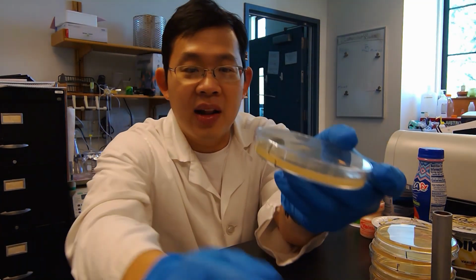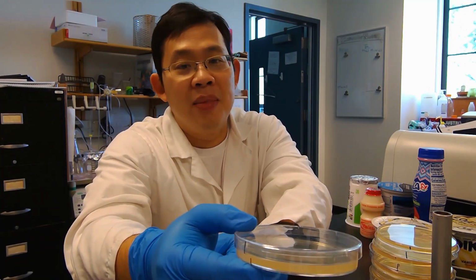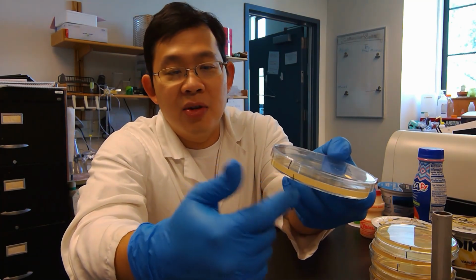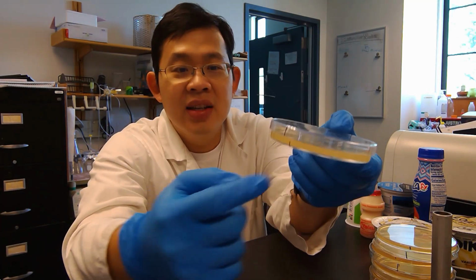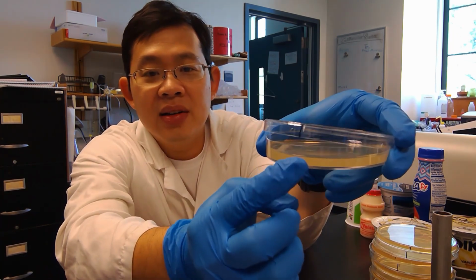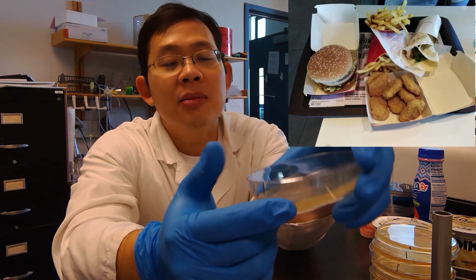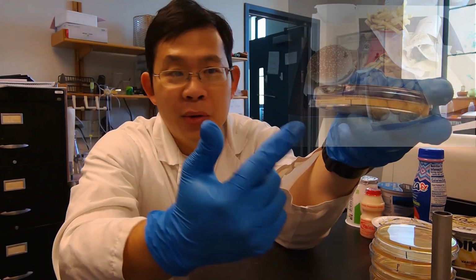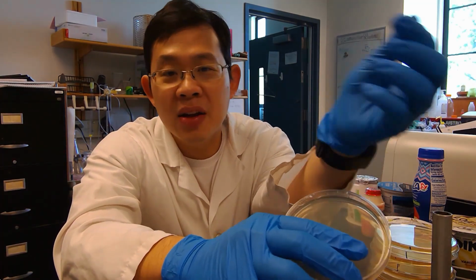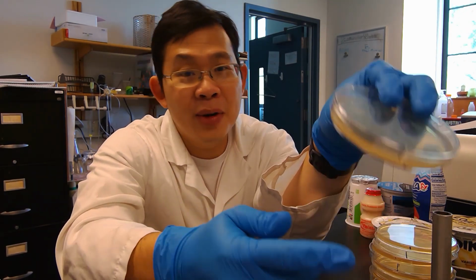Here's the bacterial standard nutrient agar that you can find in microbiology lab. Typically, they are cast in this so-called Petri dish like this. You have the bottom where you have the agar over there, because this is the food for bacteria. Now, many bacteria will be able to grow in here, but I know some organisms may require certain nutrients, and therefore may not be able to grow in here.